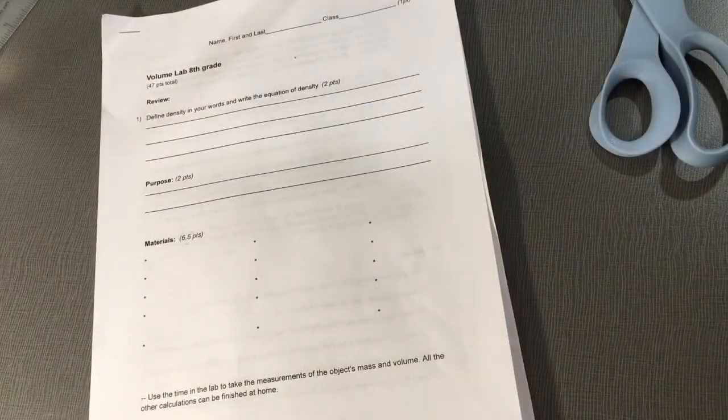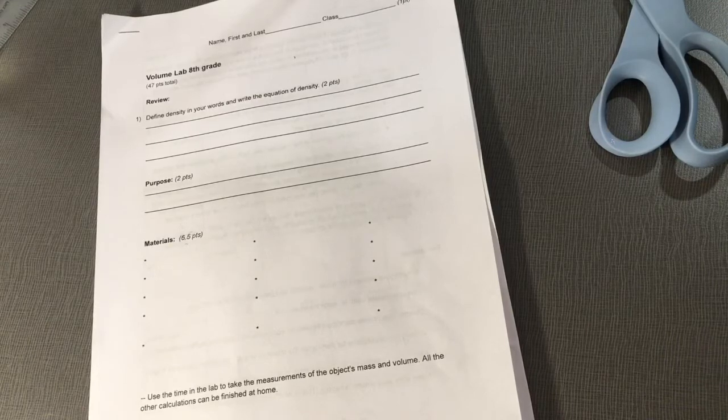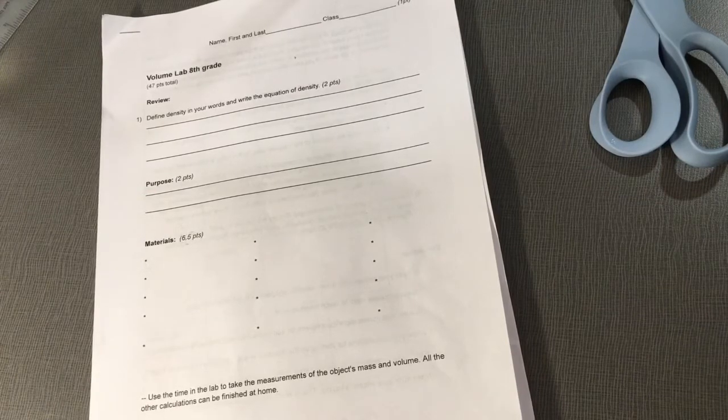All right, you are ready to begin your experiment. Remember, use the time in the lab to take the measurements of the object's mass and the volume. All the other calculations can be finished at home. This lab is designed for you to complete it within your allotted time frame.